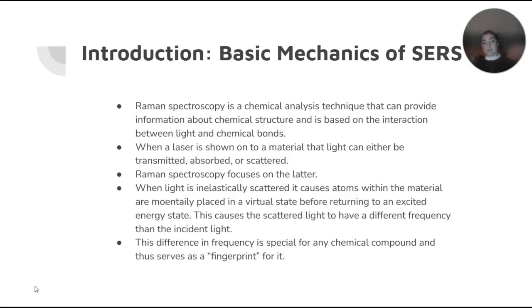The elastic scattering is something called Rayleigh scattering, which we will not be focusing on. So basically, when light is inelastically scattered or Raman scattered, the light hits your molecule, and the atoms within these molecules are at the ground energy state or a higher energy state, and the molecules are sent to a virtual state very briefly before falling back down to either the ground state or an energy state.